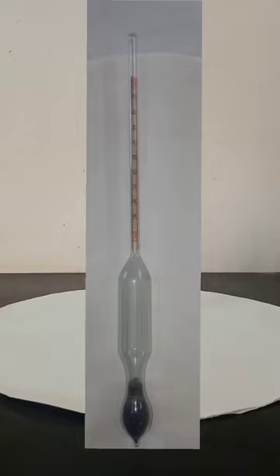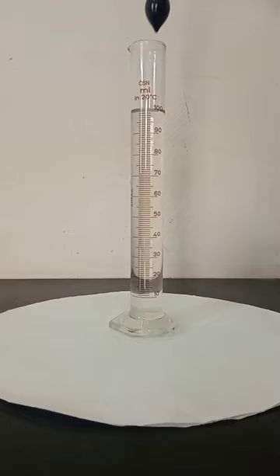A hydrometer is an instrument used to determine specific gravity. It operates based on the Archimedes principle that a solid body displaces its own weight within a liquid in which it floats.